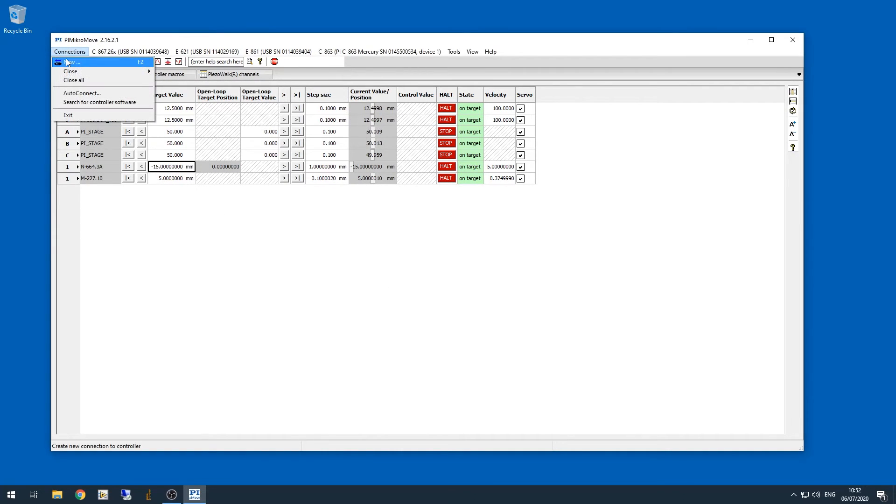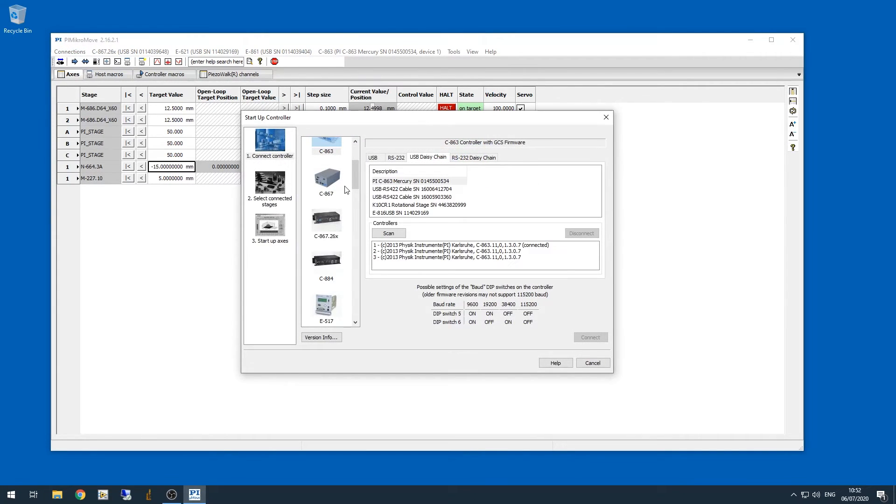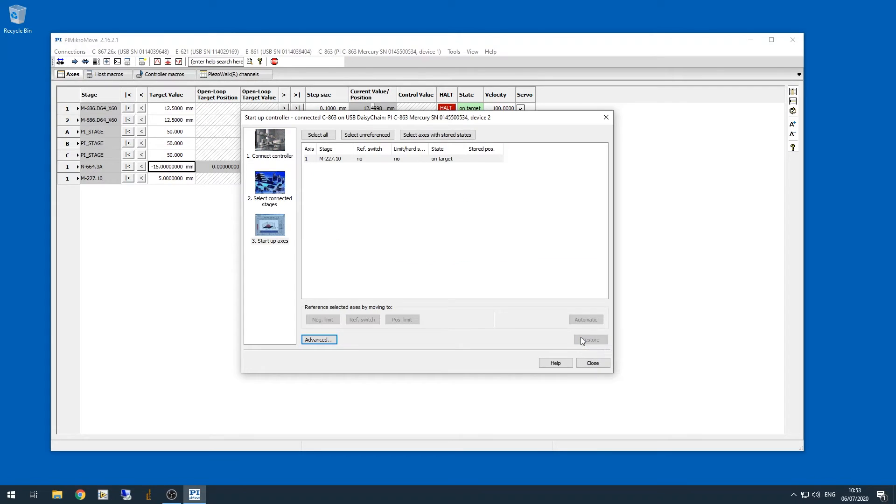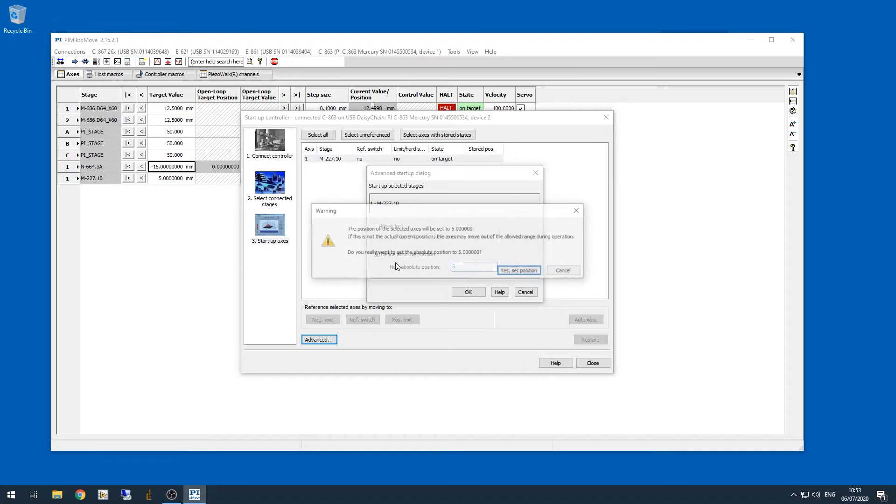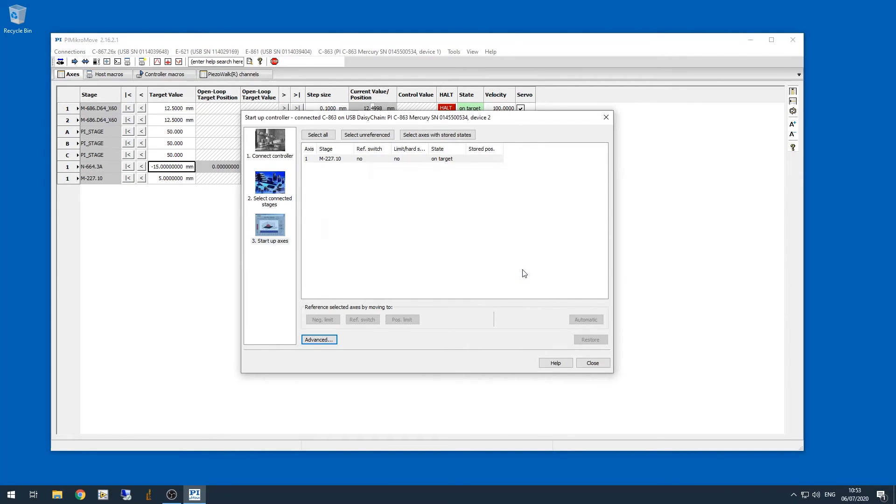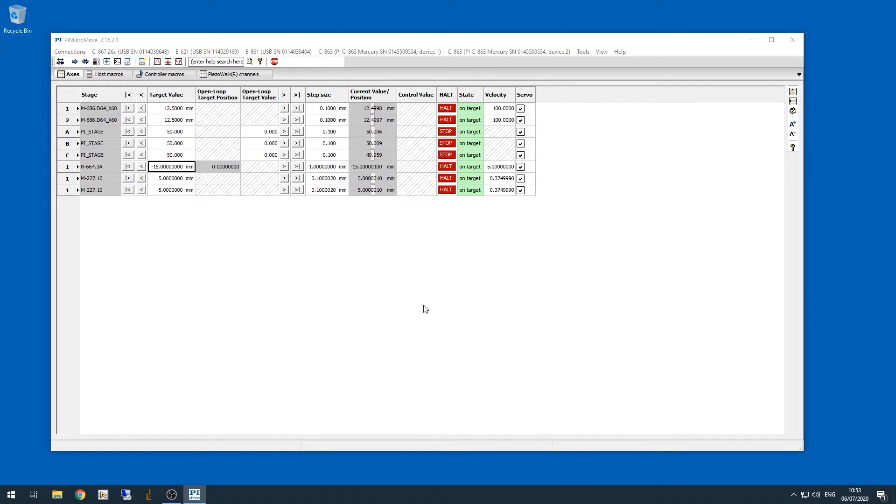Now we need to connect to the other two motors, so we go back into the new connection window, and you can see that the first motor shows up as connected already, so we'll select the second motor and we'll click connect. Now it's the same process when we connect to the second motor. We also have to click advanced, type in a new starting value of 5, click yes, and click close, and then we'll do the same thing for the third motor.